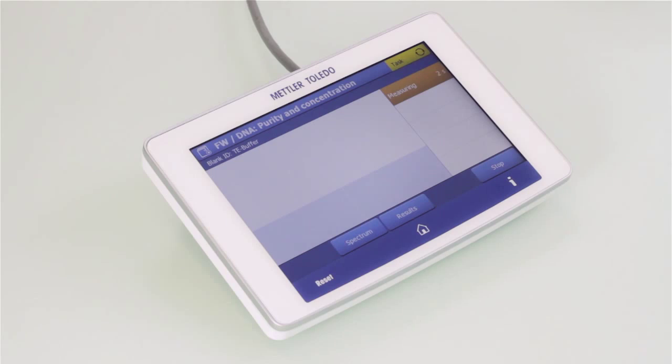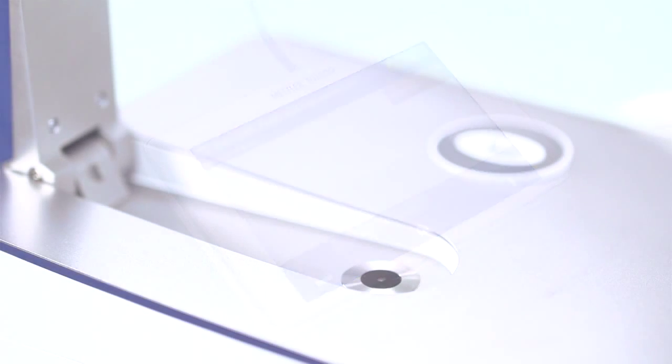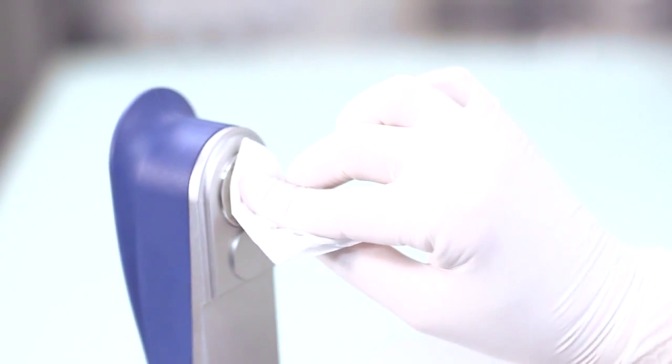After closure of the arm, the blank is automatically measured. Both the surfaces of the microvolume platform and the reflecting mirror can be easily cleaned with a tissue paper.